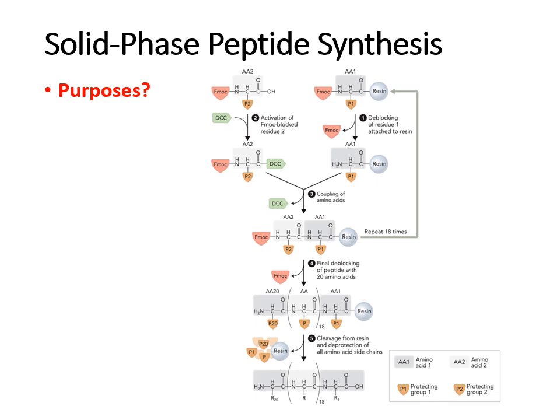It can also be used to test biological activity and look at substrates for reactions with amino acids that aren't the natural ones that you would see. But again, I just want you to know this is a way solid phase peptide synthesis, which is shown here, can be used to synthesize antigens for antibody production.